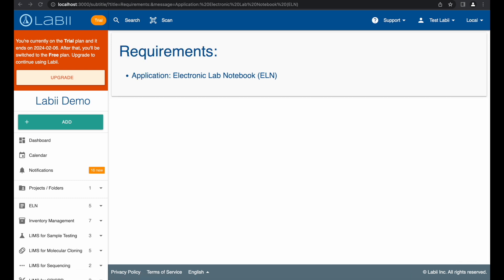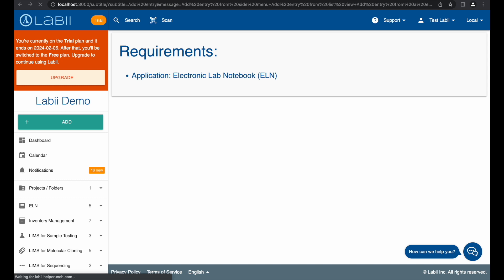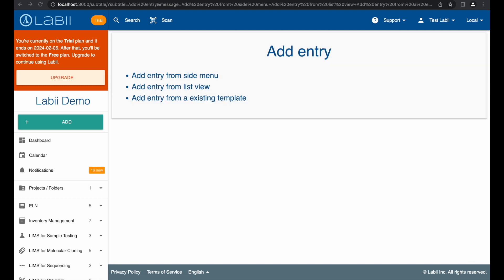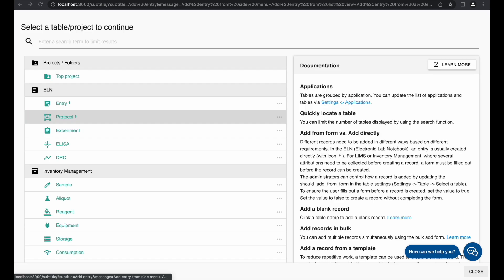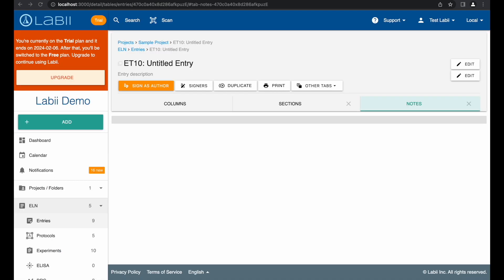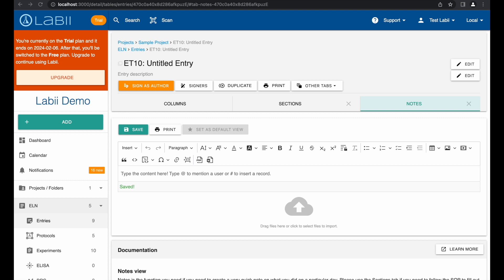In order to get started, you will need to install an electronic lab notebook. Just like with all other Labii records, you can add a new experiment entry from the side menu, or from the entry list view. You can also add a new entry from an existing entry template. Click the Add button from the side menu and then select Entry in the list. The newly created entry will be displayed. The title and description of the entry can be updated by clicking the Edit button.